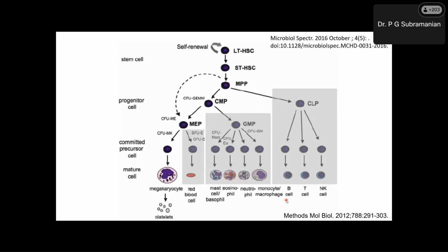So the question was, how do you decide the number of events? Basically, it depends on what level of sensitivity we want to study. If you want to study 10,000 cells, then you acquire the number of events accordingly. Of course, you have to disregard the debris and platelets which are there. It's a little technical question based on the gating system and viability. When we discuss the plot, probably at that time I will tell you more. But the decision on the number of events is based on the number of cells you want to study.